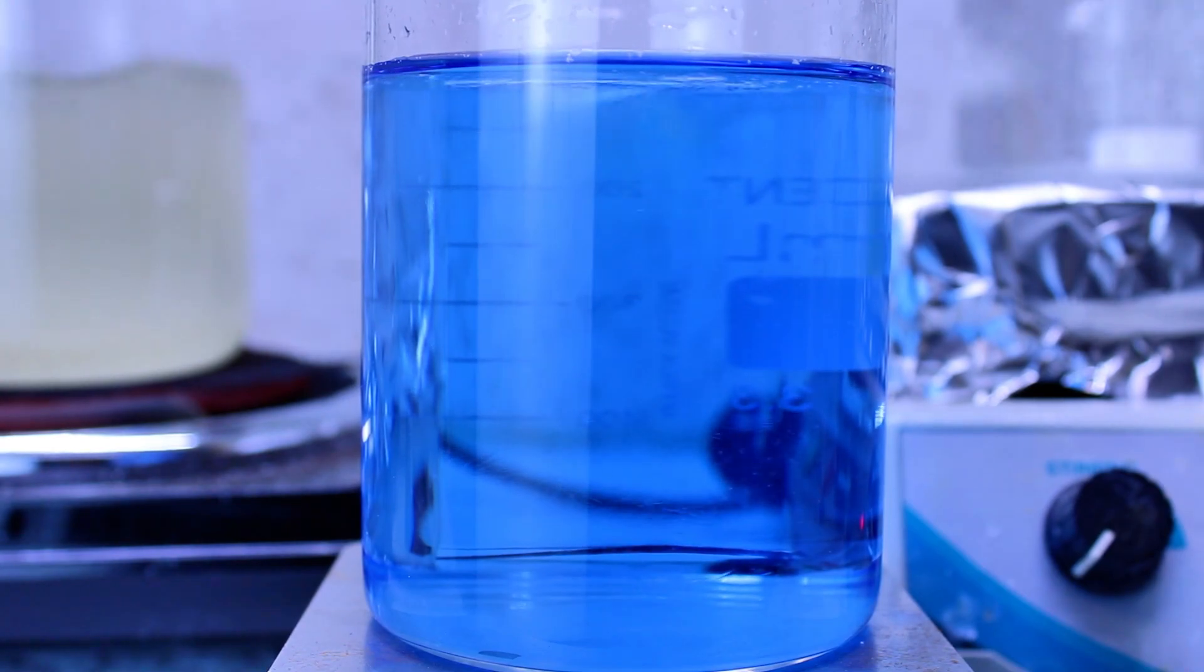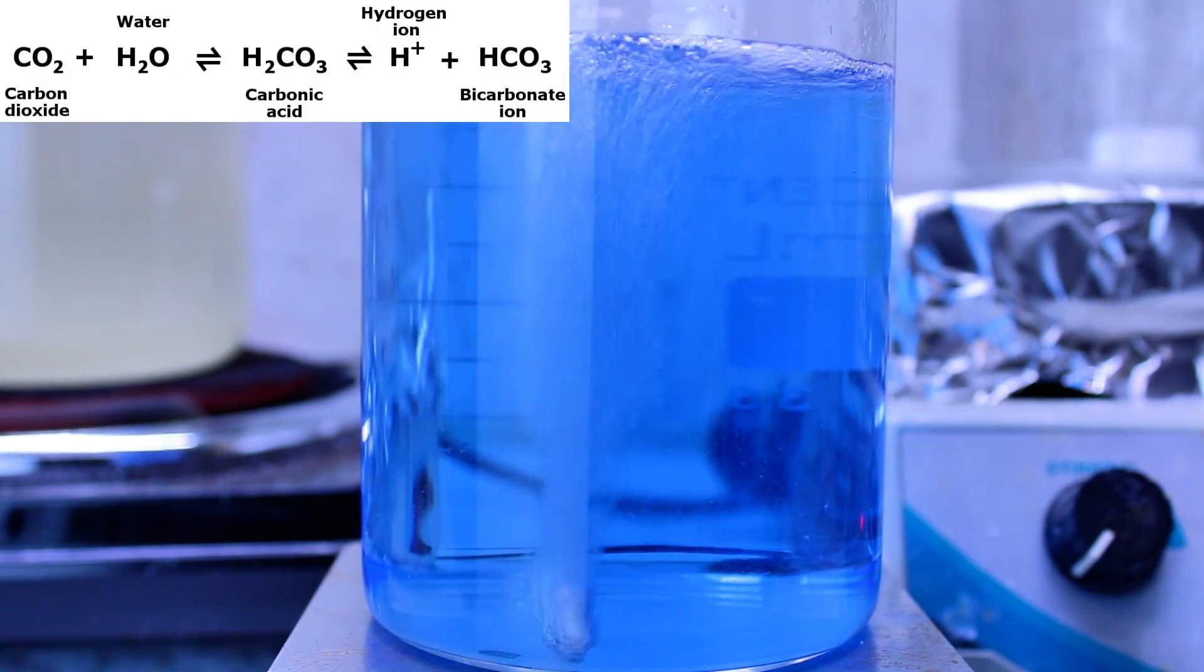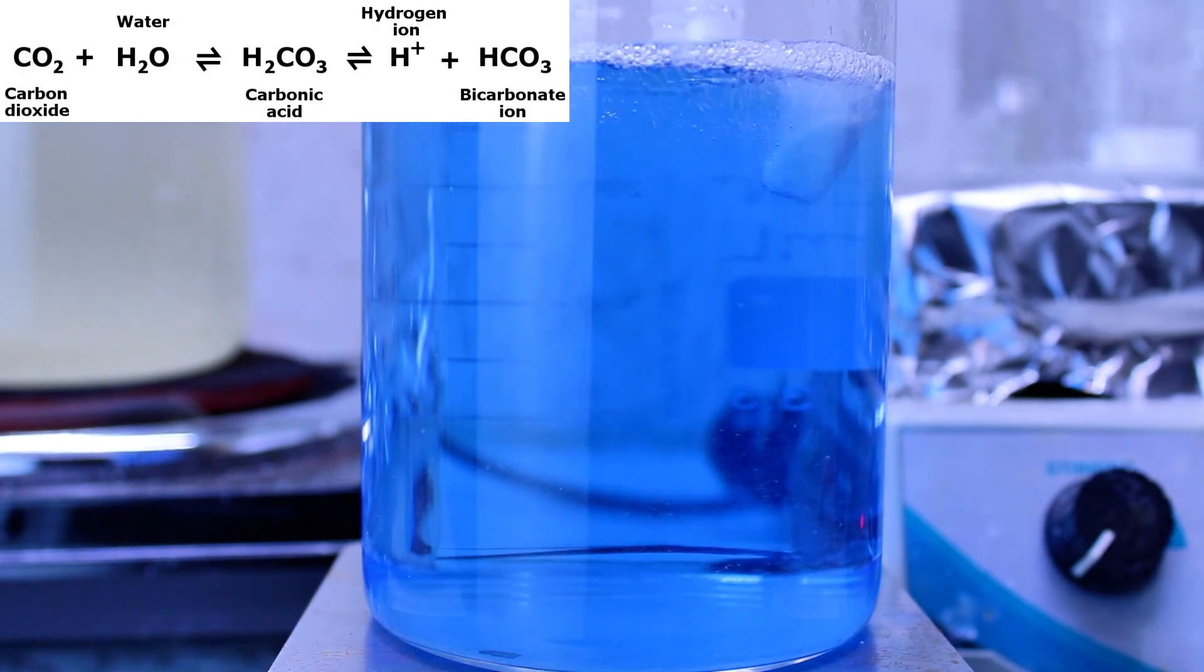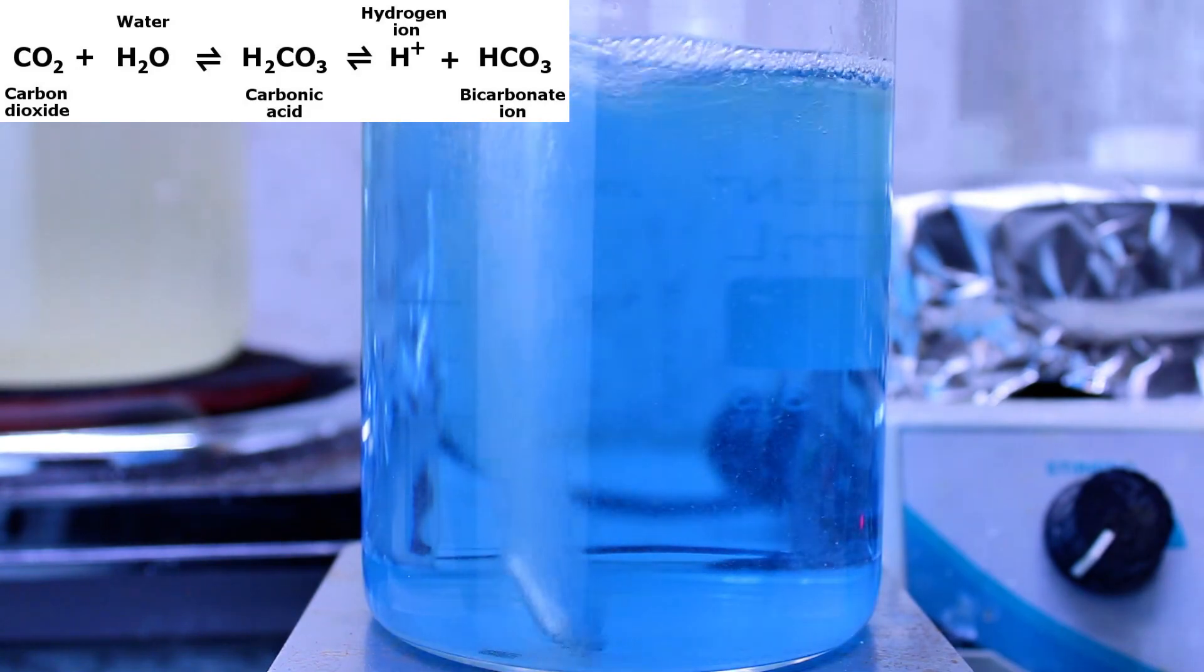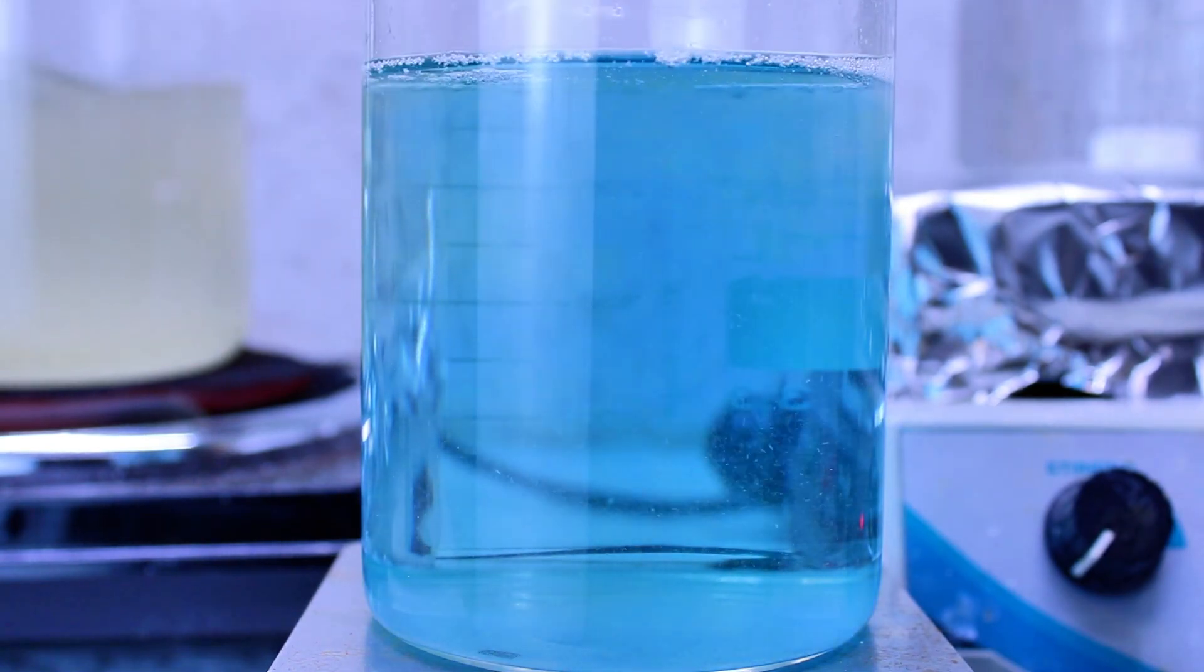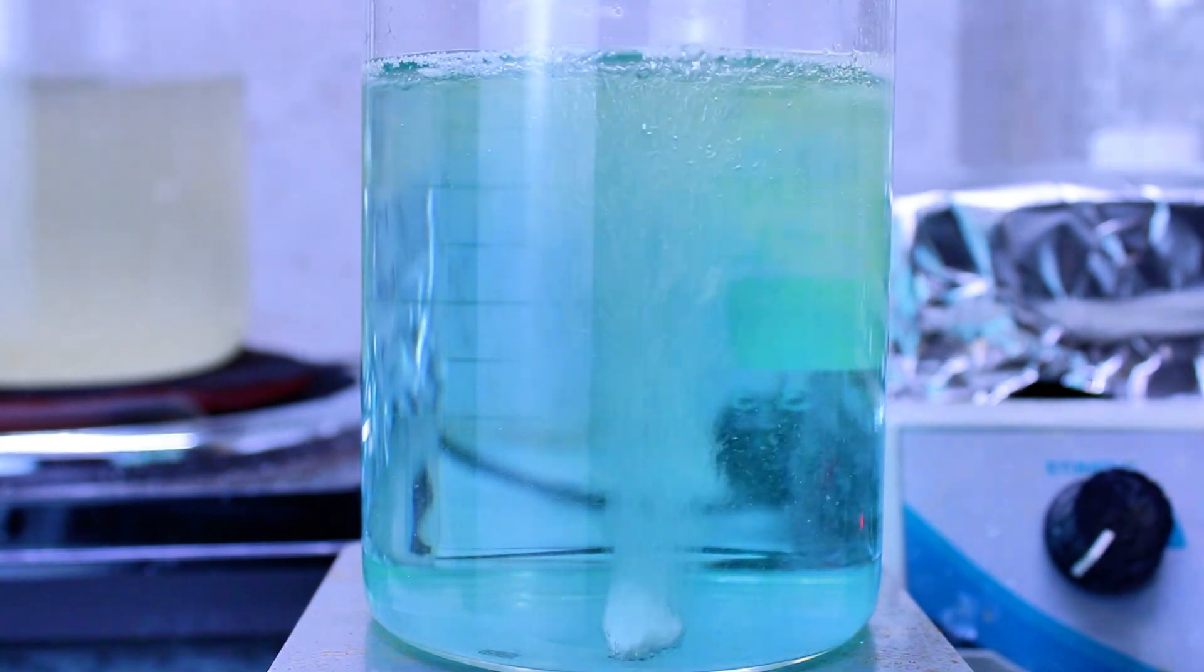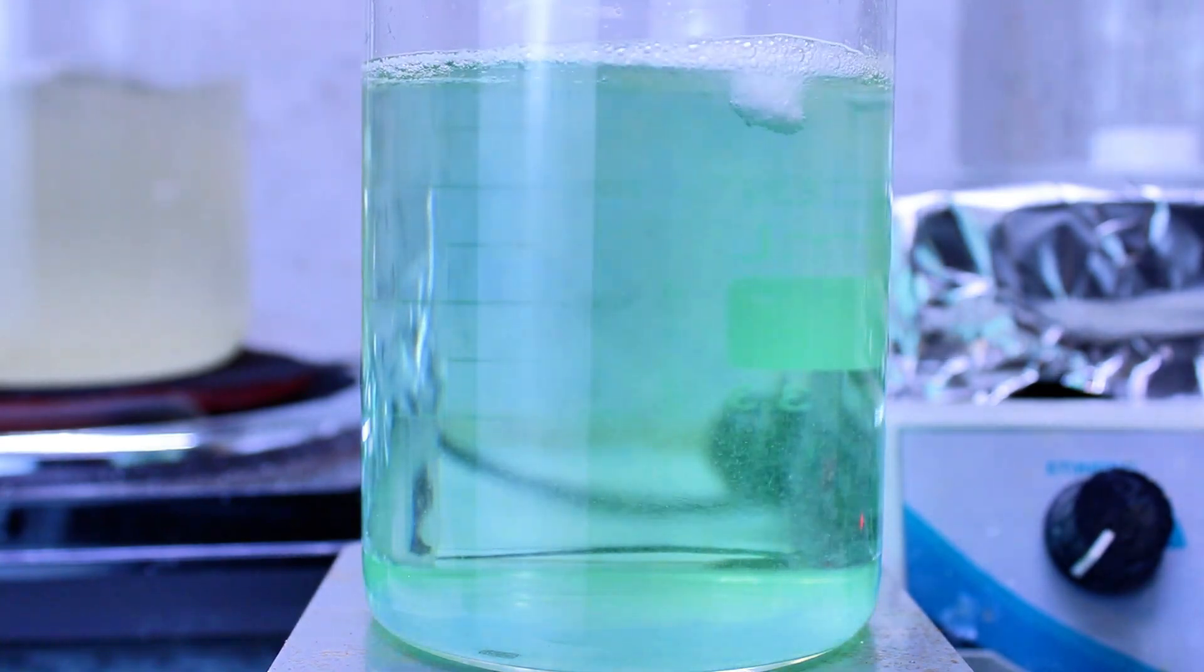Due to the addition of the ammonia, nothing visible happens at first, but as the CO2 reacts with water, it forms a weak acid called carbonic acid. As the concentration of this carbonic acid increases, the pH becomes more and more acidic, which results in the indicator changing from blue to green to yellow.